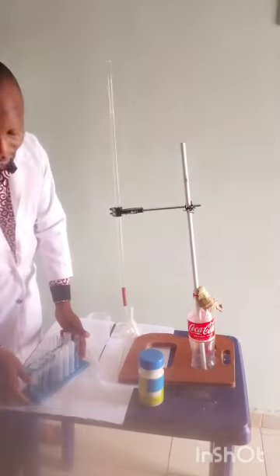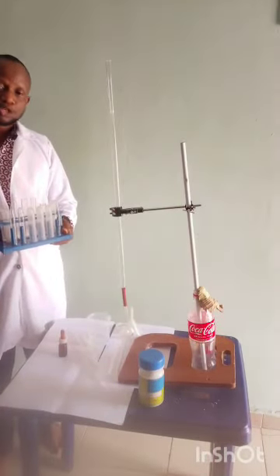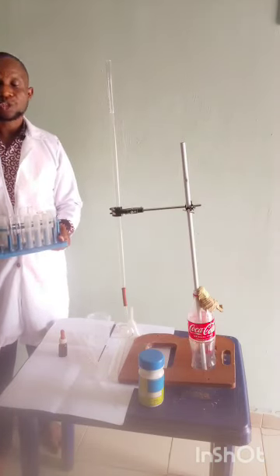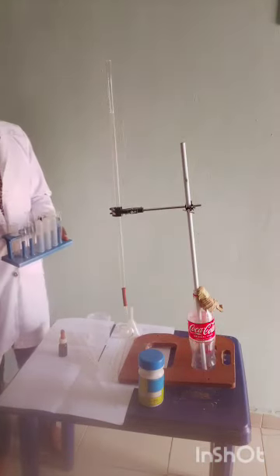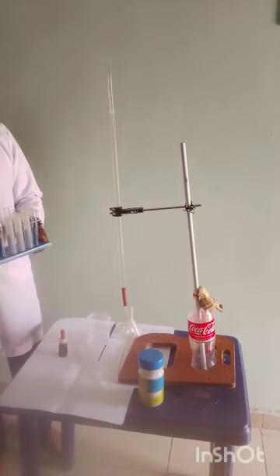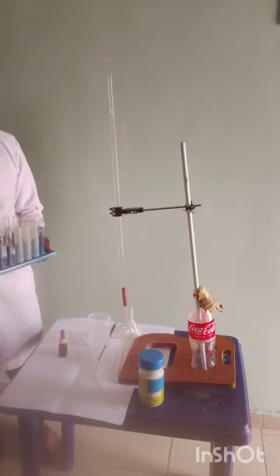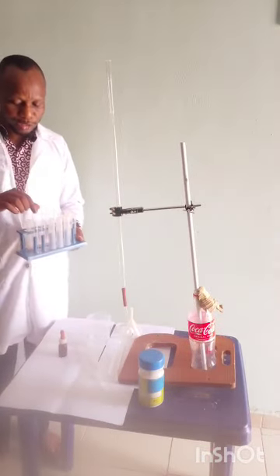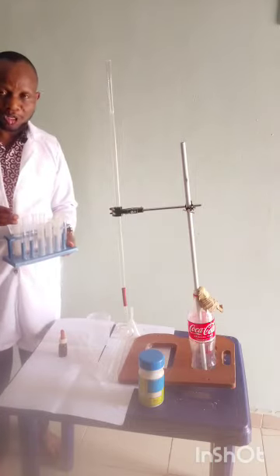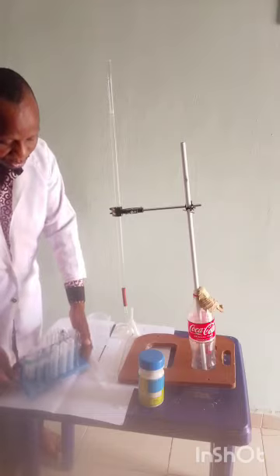Quickly, on the second aspect of the chemistry practical, this is a test tube rack. Here we have the test tubes that we use in carrying out the anion and the cation tests, the precipitation tests, such as barium test, the silver nitrate, barium chloride, identification of anions, and the likes. So we have the test tube rack, the boiling tube, and the test tube we'll be using for such experiments.